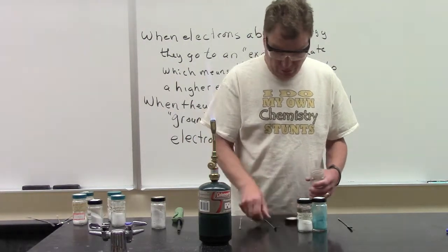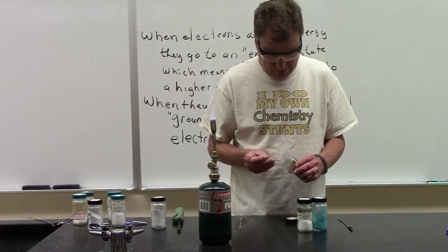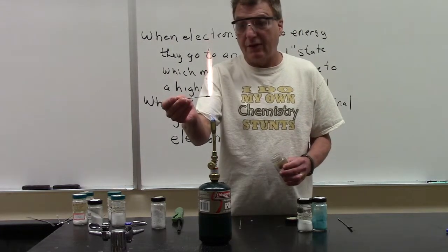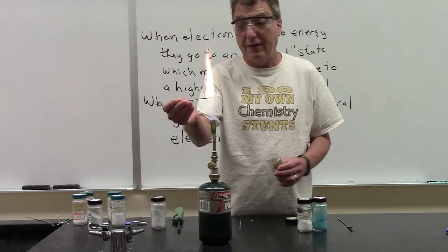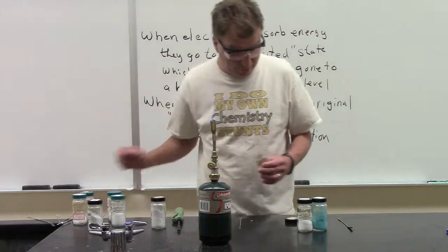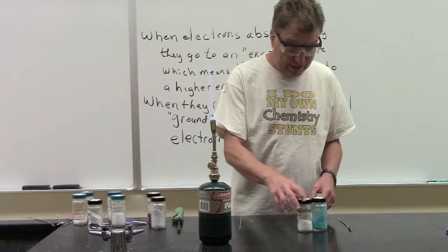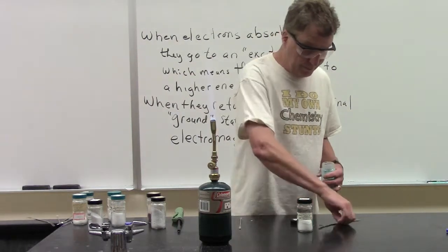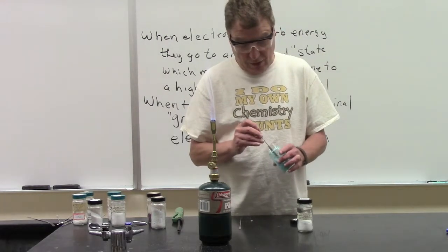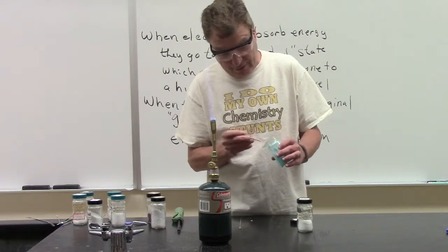Let's look at cobalt chloride. And it just sparkles like that. That's really pretty. Another use of these kind of colors is this is what makes the colors in fireworks. So you get to see these every 4th of July. And often at a wood stove store, or even at a Walmart, in regular stores, you can buy stuff that will make colors in your fireplace. And that's what these are.